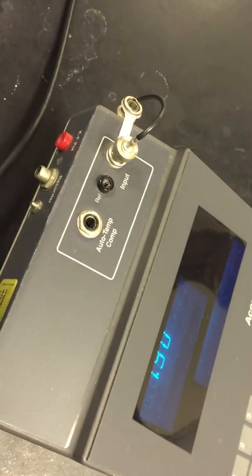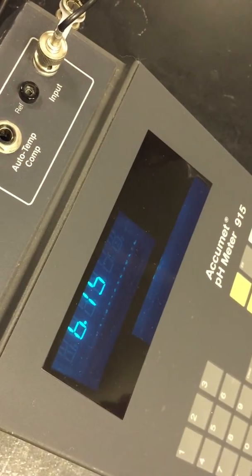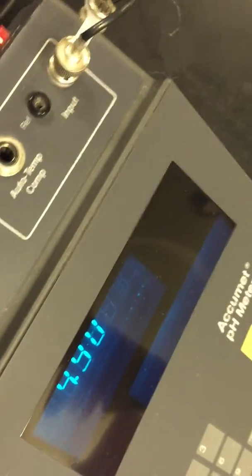Until the pH goes to 4.5. See, you can add drops when it is 5. After 5, you can add drops, because we want to catch exactly 4.5.